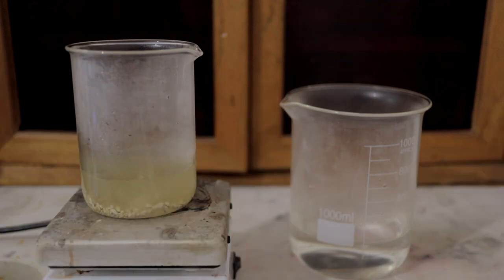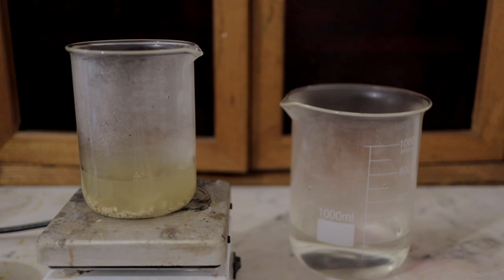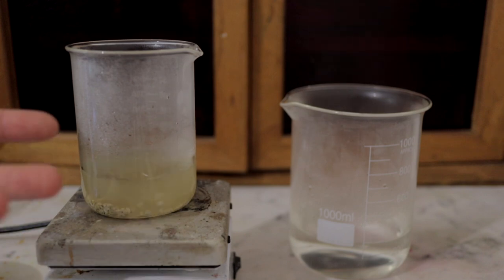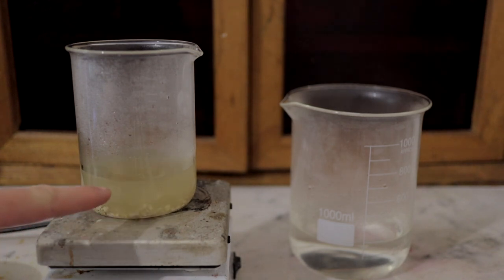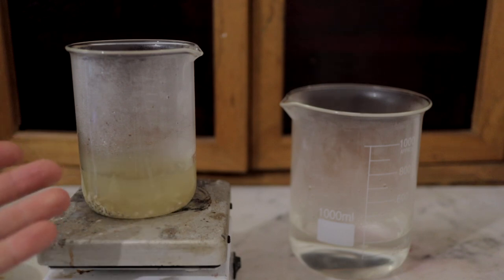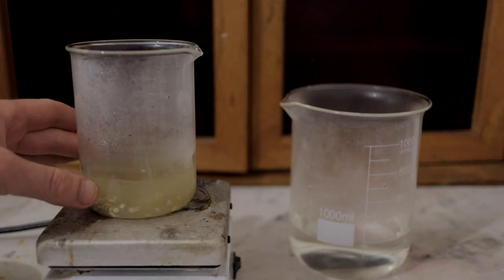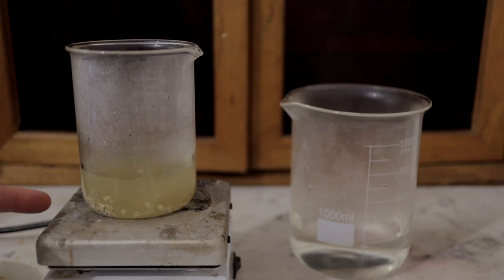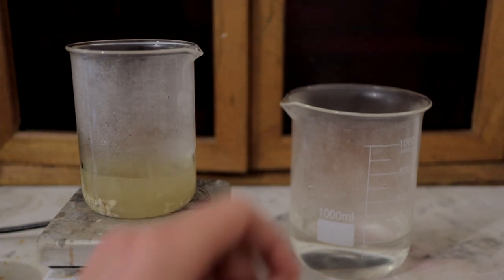If you use too much water now, you're just going to increase the time the process takes. Using hot water also helps the salts dissolve much quicker. As you can see, there's a yellowish discoloration in the potassium sulfate, which I think is probably some sort of iron compound contaminating it. That's going to be bad for our final alum, but I will show you how to purify it and make sure the alum is iron-free.